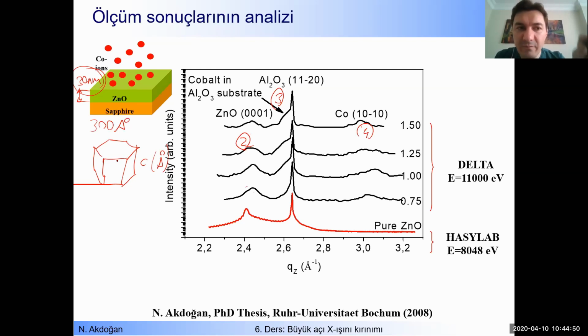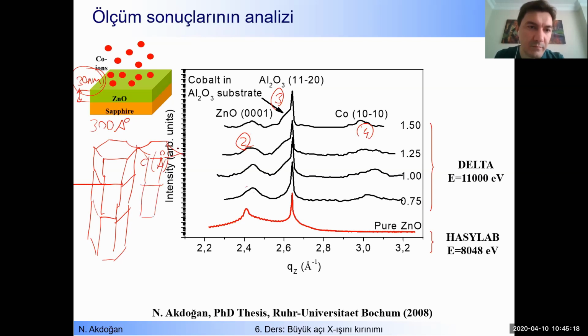We have many zinc oxide layers, and we have many hexagonal crystals. They are arranged like this, okay? Many of them, maybe 100 unit cell layers you can consider. Okay, let me also draw like this. I'm looking from the side, okay? So let me also finish that part.